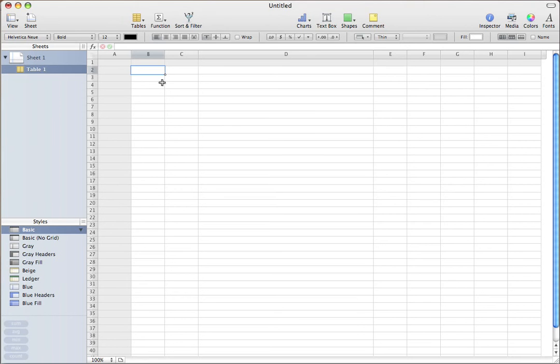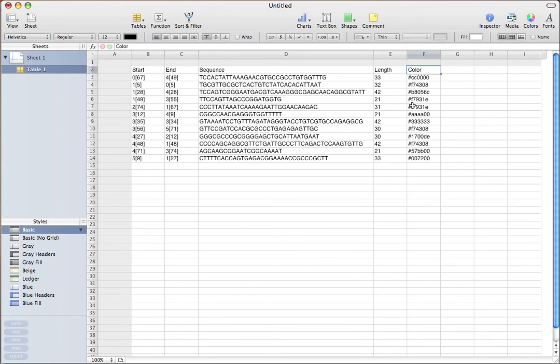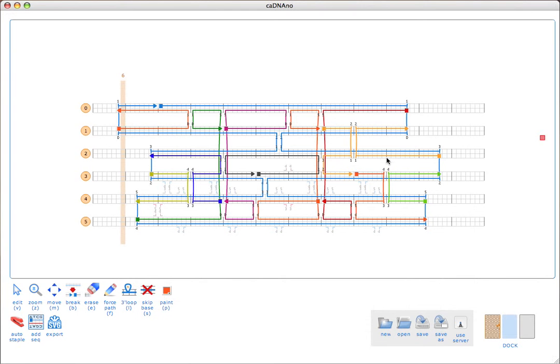I'll just go into Numbers and paste the sequences into the spreadsheet. We just see the same information we have here. One cool thing we can do with the spreadsheet is actually use it to group our oligos if we want to pipette them in different groups when we're actually doing a folding experiment.